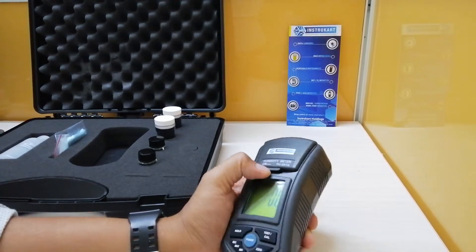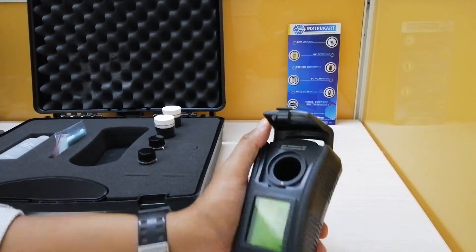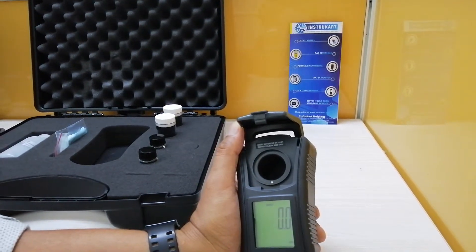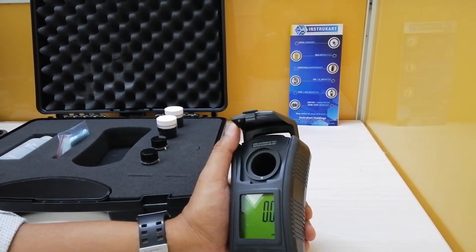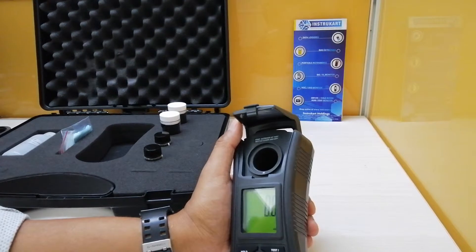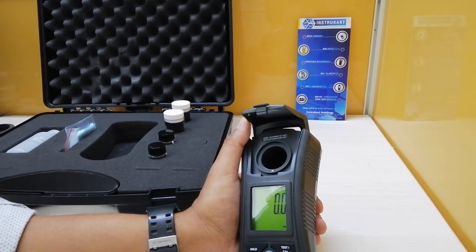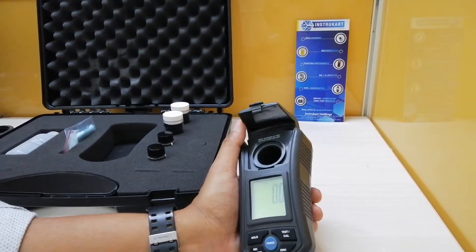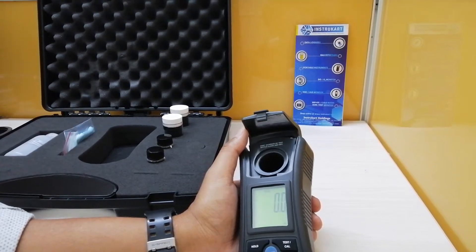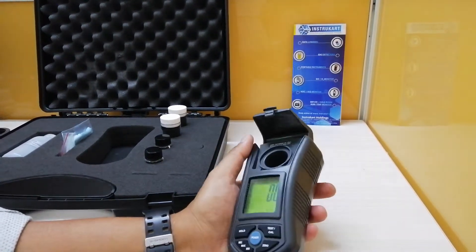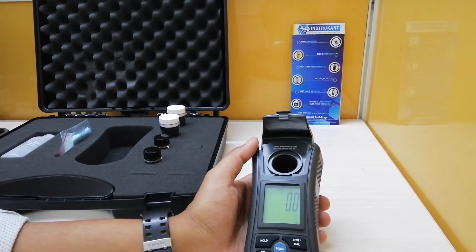To do that we need the sample volume of minimum 10 ml. Other features include the data hold facility, memory recall, and the display sampling time is approximately one second. The calibration points are between 0 NTU and 100 NTU.